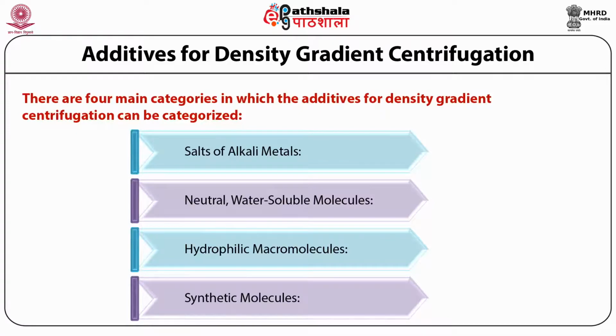With high ionic strength, intramolecular hydrogen bonding in protein and nucleic acid protein complexes can be impaired by the chaotropic effect. Hence, such salts are mainly used during the separation of DNA and RNA. The most frequently used salt is cesium chloride. However, other salts such as sodium bromide, sodium iodide, cesium sulfate, cesium acetate are also equally good. It is interesting to note that the hydration of the molecule directly affects the density of the sample.